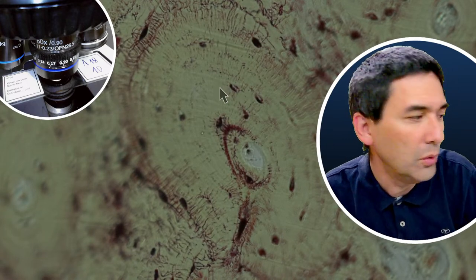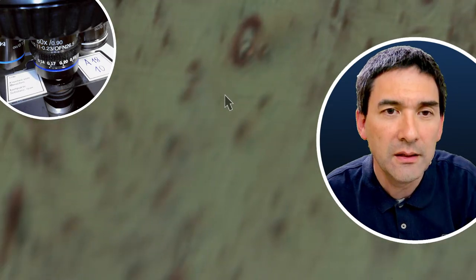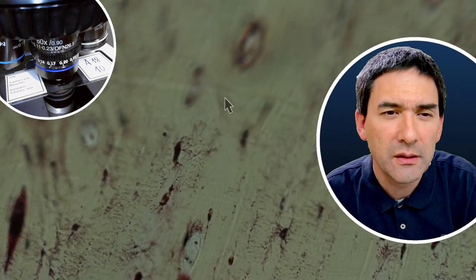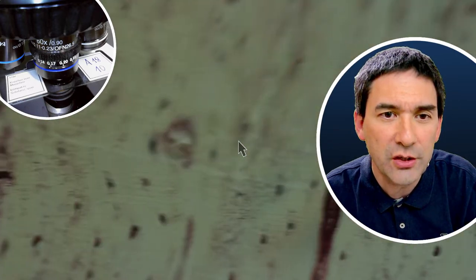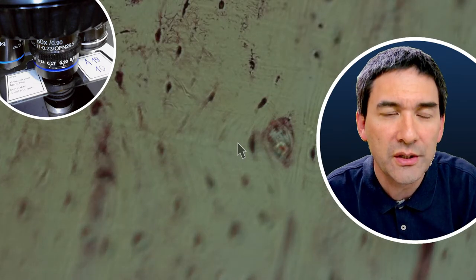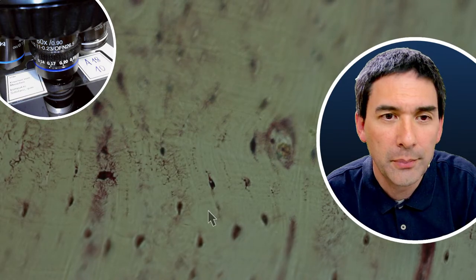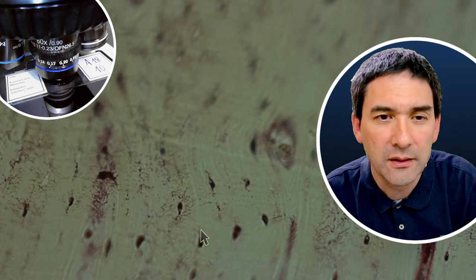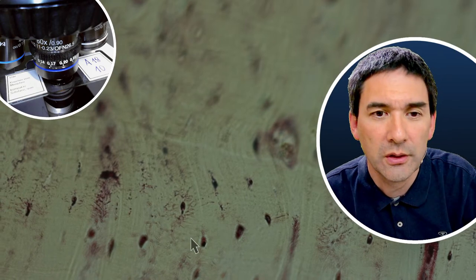And if you go to the other end here, where we had it at the beginning, you're going to see it looks much more longitudinal, because it's a different section. It's a longitudinal section, and therefore you don't see the round structure anymore, because it's cut differently. But still, you are able to see those individual dark bone cells here.